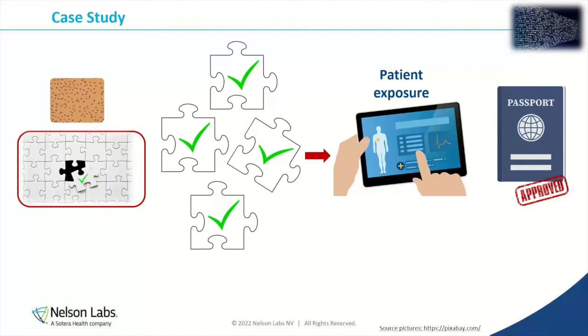So this is a more complex case, and I would say more rare. It is more rare that we come up against this. Usually we can identify a cause. Like Lisa said at the beginning, she was pointing out, you'll have latex, or you'll have a metal, or you have an antimicrobial agent in there. Those things we do expect to fail cytotoxicity, so we can walk through this a little bit easier. But even if you get to the point where you've checked everything and you're at the end, we still have an out with combined expertise to get this path forward approved at the very end.